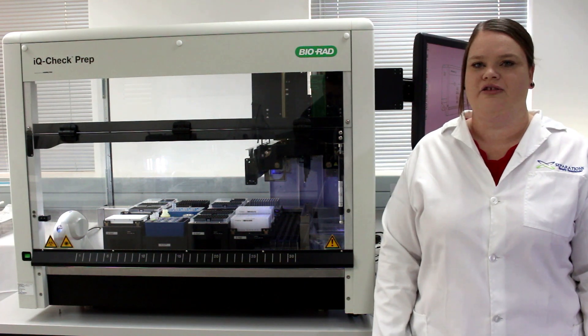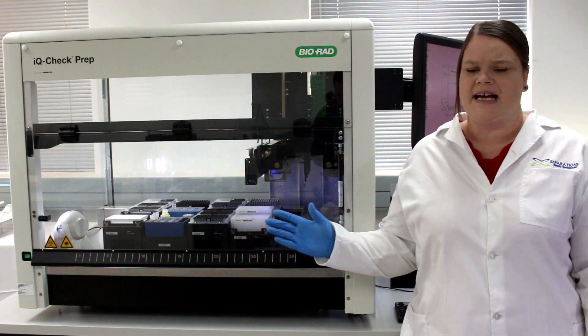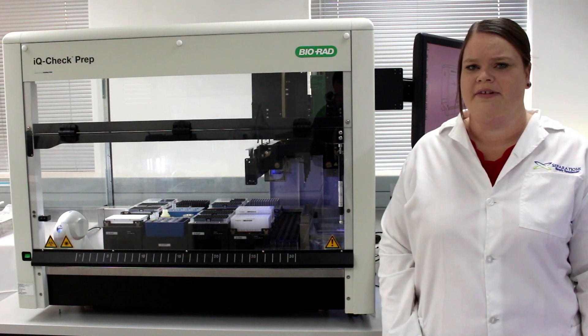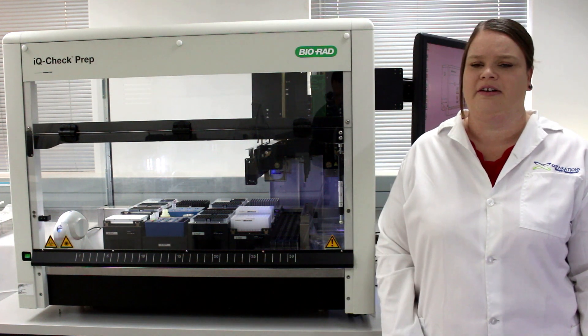Today we're going to chat about the BioRad IQ Check Prep. This system is fantastic for anyone in the microbiology field, both service labs as well as manufacturing labs.